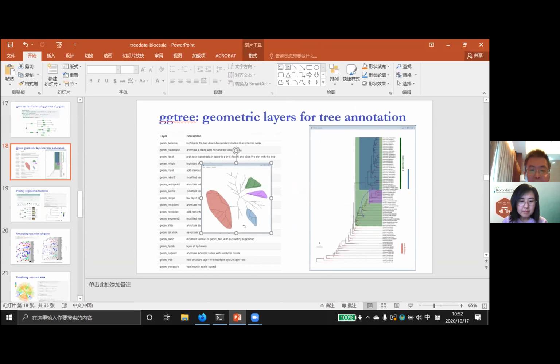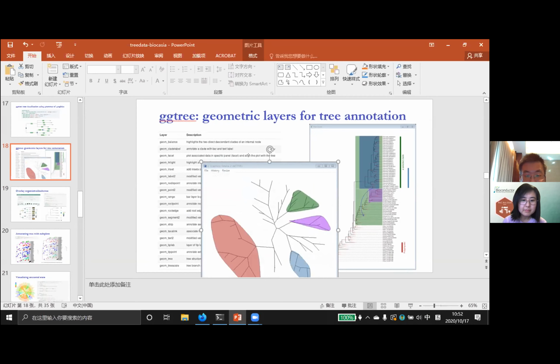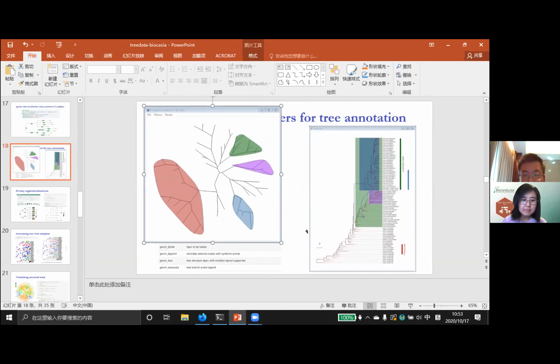You can easily imagine the blue overlapping on the purple, which would not look as beautiful. You could move the branch near the purple or green, which is not going to be good because everything is clustered together. So I'm wondering if you did that automatically or if you actually specify a parameter to place it in the right corner. We need to specify parameters. Okay, you did. I was just wondering if you have that.